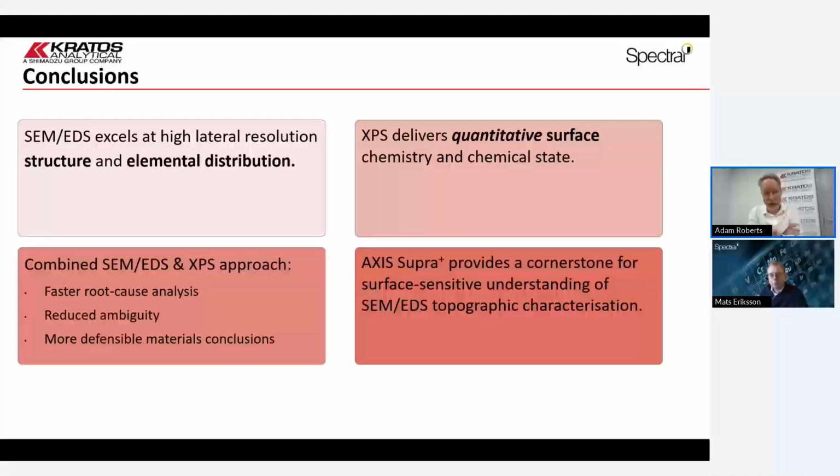magnesium, zirconium has been used in the past, chromium, gallium. So if you want a continuously variable source, you're then going to look at using a synchrotron source, which is beyond the remit of where we are.